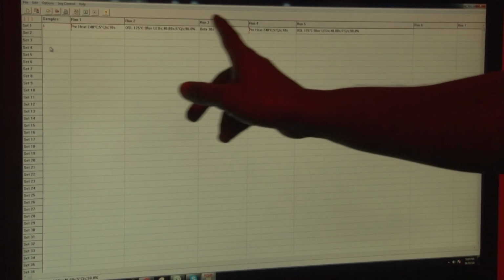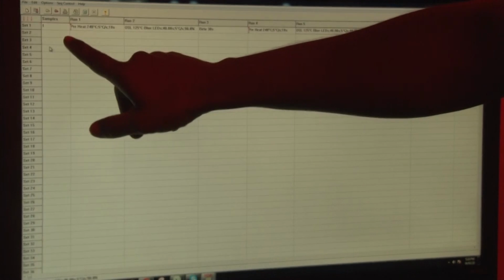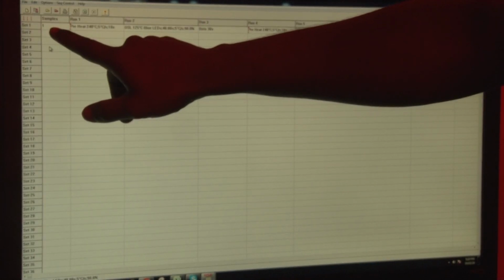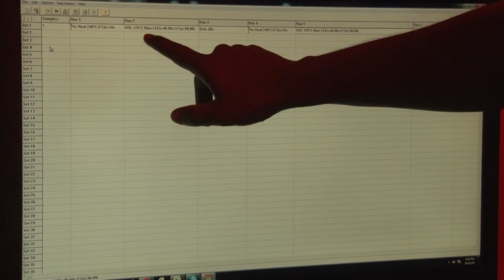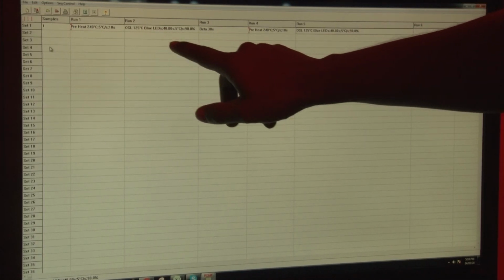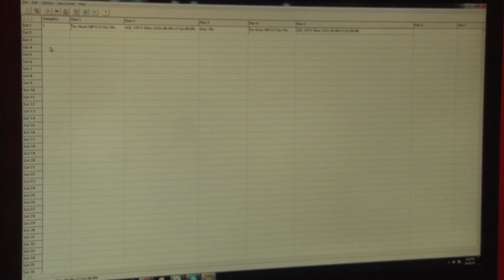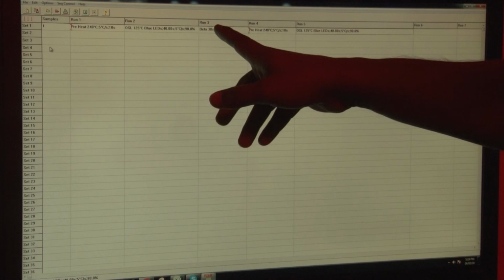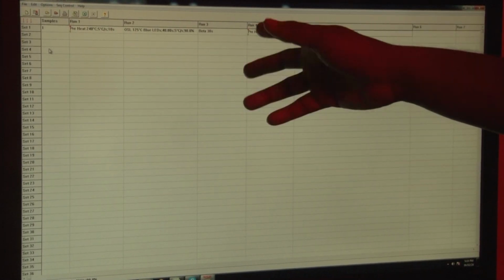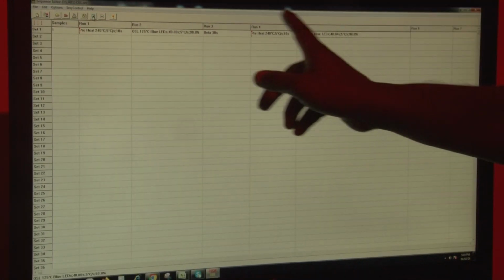Here we have prepared one sequence for this sample. As we have put one aliquot on position number one, we will first preheat this sample, then we will stimulate with the blue LED, and then we will give the beta dose for 30 seconds, because this sample has a dose of 4 gray. In the second it would be around 30 or 40 seconds. Then we will again preheat and then stimulate. So we will run this sequence.